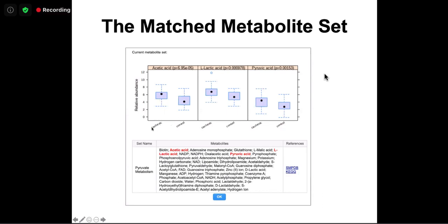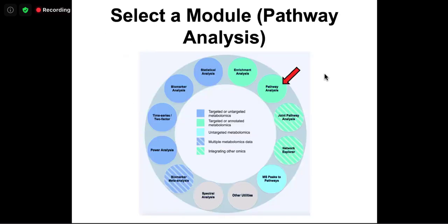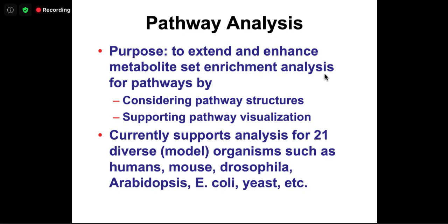This is cancer, cachexic, and control, and you have three matches, and it seems they're all considered higher in the cachexic versus control. And that's enrichment analysis. So enrichment analysis is really testing your set. This set is just a text you put, you just put it there. You don't have a structure, okay? So you don't know who interacts, who is turned on first, who's second, you don't know that. You just know they changed together as a signature. So pathway analysis is more refined, because pathway actually contains more knowledge.